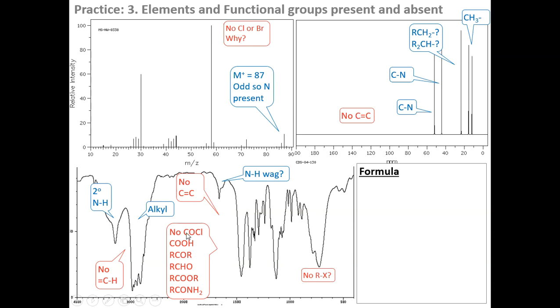And as I said, there's no carbonyl, and we can see that very clearly as well in the NMR. So all these functional groups are absent. Make sure you list them.